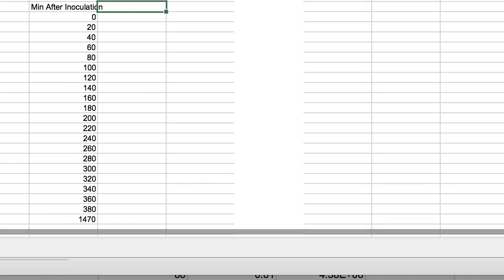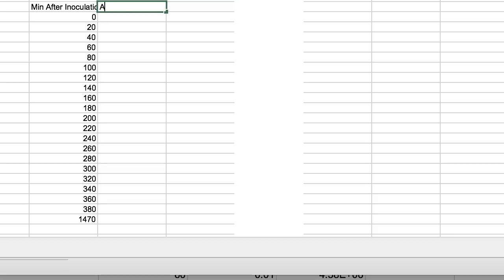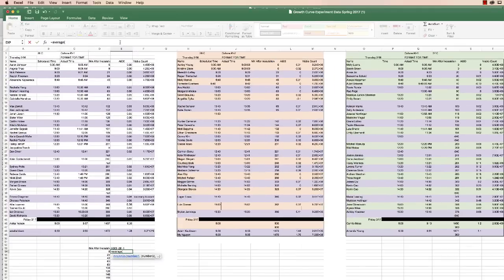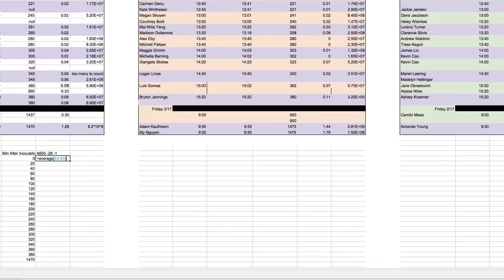Next, set up the A600 column. Call this one A600 28-1, then type equals average, open parentheses, grab those two readings from up in the table, close parentheses, and hit Return. Then do it again for the 20-minute time point: type equals average, select the next two values, and you have it.